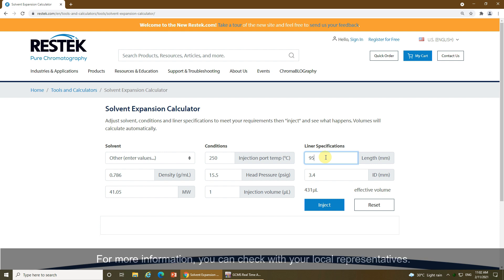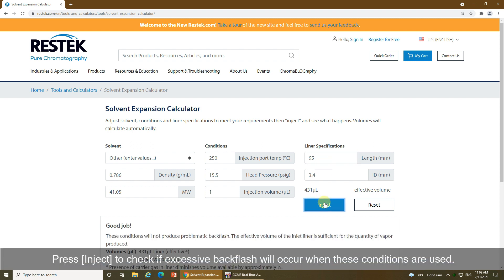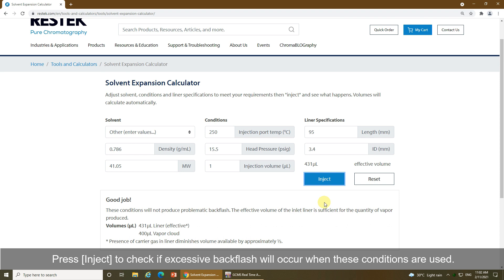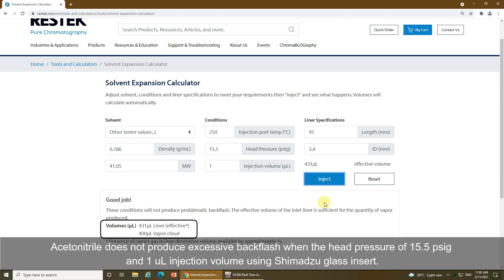For more information, you can check with your local representatives. Press 'Inject' to check if excessive backflash will occur when these conditions are used. Acetonitrile does not produce excessive backflash when using a head pressure of 15.5 PSIG and 1 microliter injection volume with Shimadzu's glass insert.